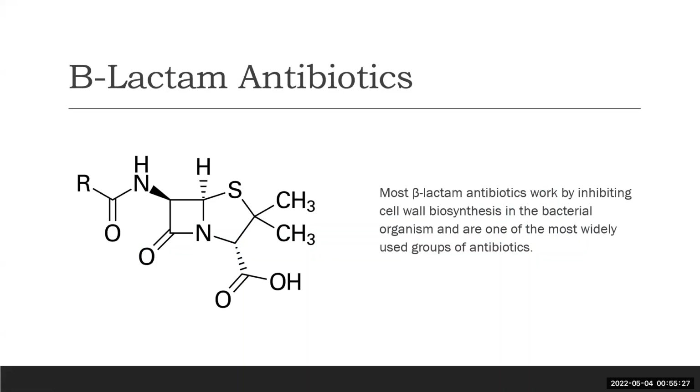Okay, so we are going to be doing an experiment where we are going to be making derivatives of penicillin, or changing part of the structure to see if the molecule retains activity or loses activity as an antibiotic. This is the core structure of beta-lactam antibiotics.